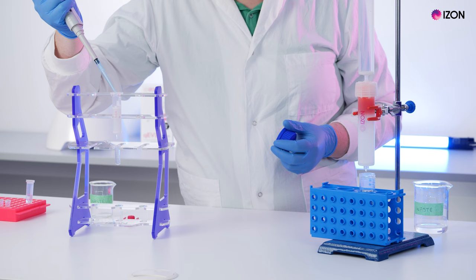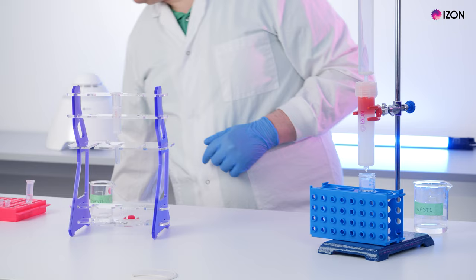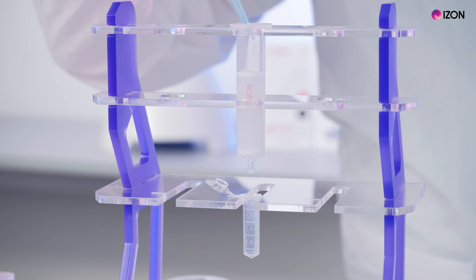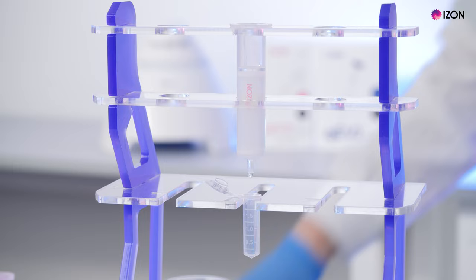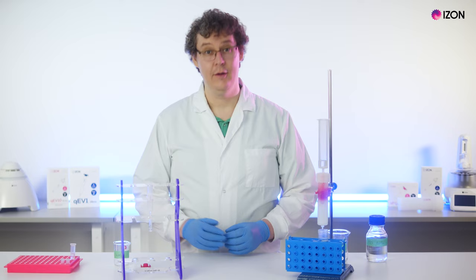For example, if you are collecting individual fractions on the QEV original Gen 2, optimizing for EV purity, then you would add 0.4 milliliters of buffer to the column. Then collect 2 more fractions of 0.4 milliliters each.